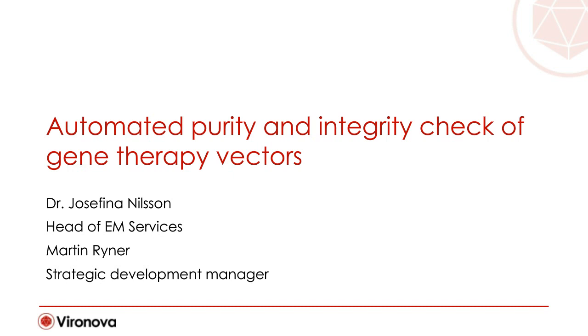Thank you very much, Joanna, for the introduction. So today, Martin and I will talk about automated purity and integrity analysis of gene therapy vectors. However, this approach can actually be used for any sample containing whole virus particles.